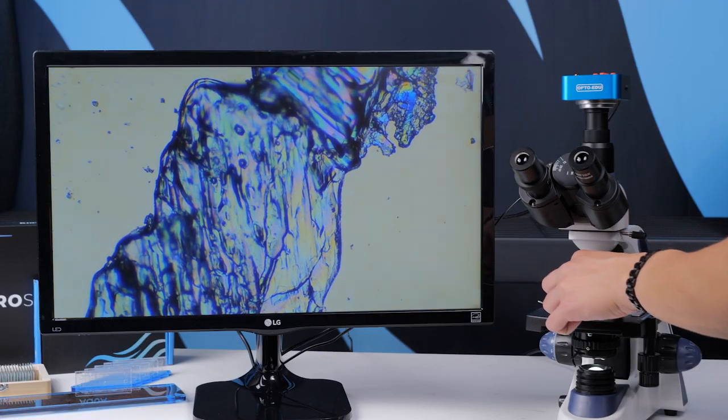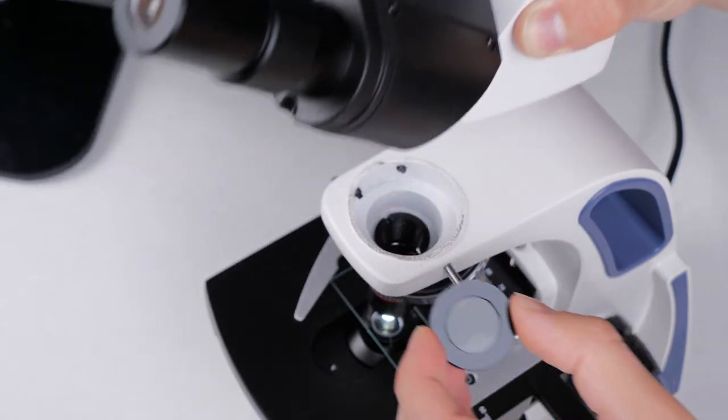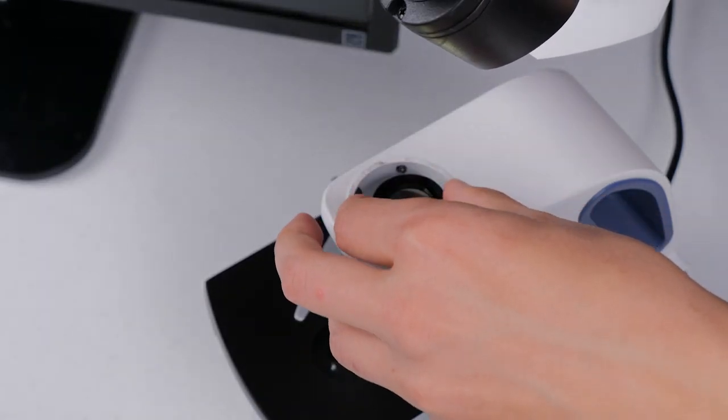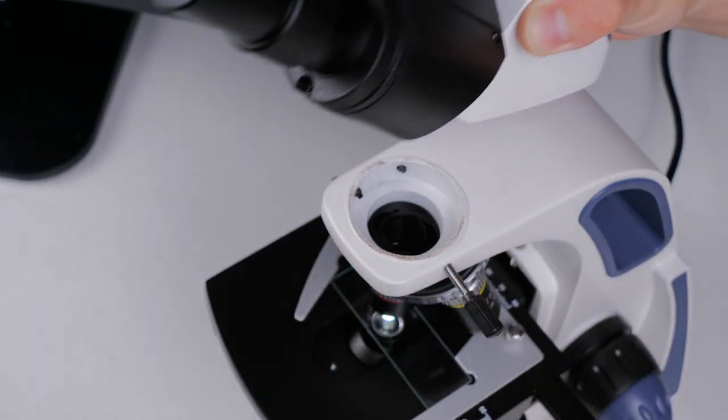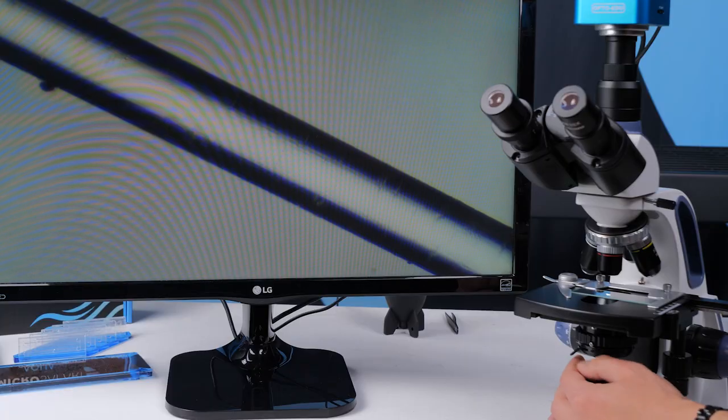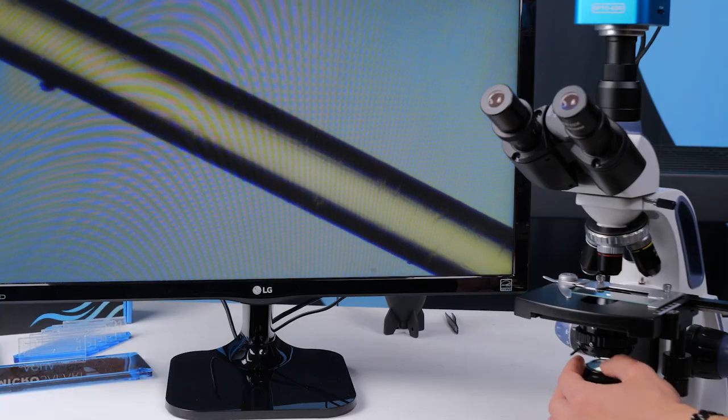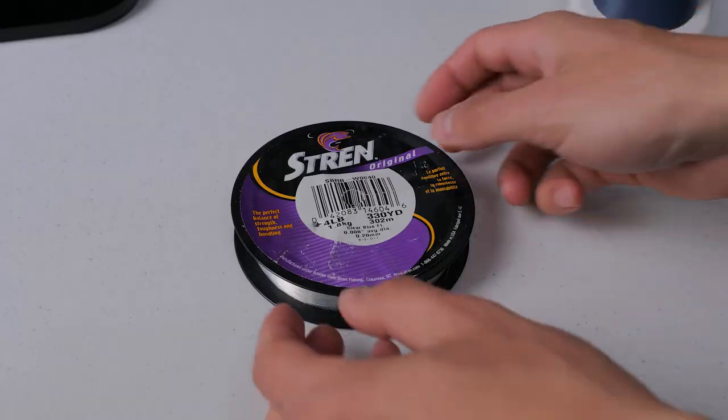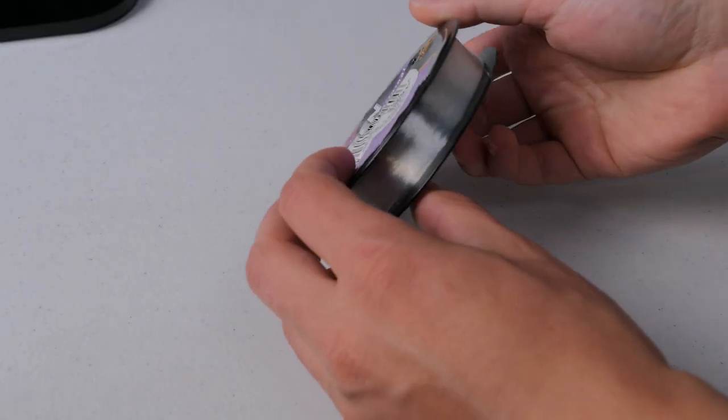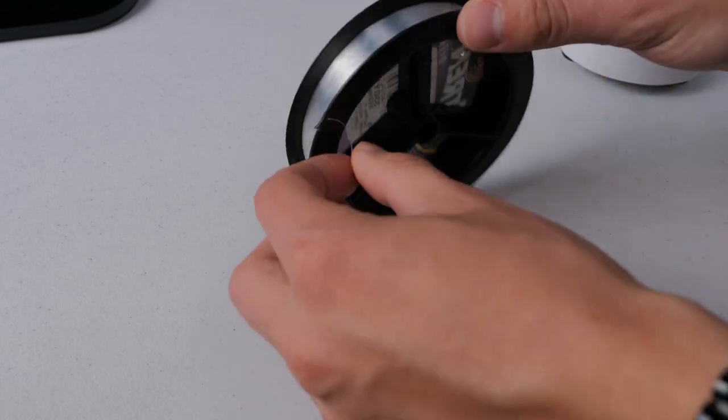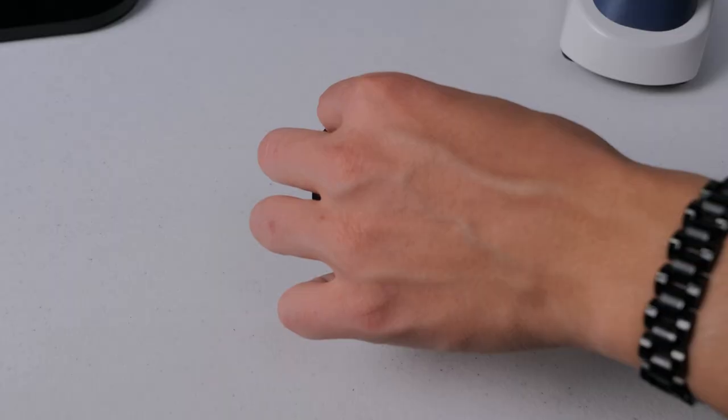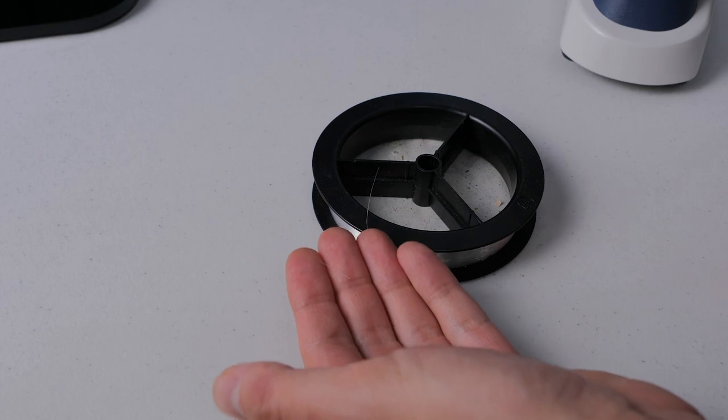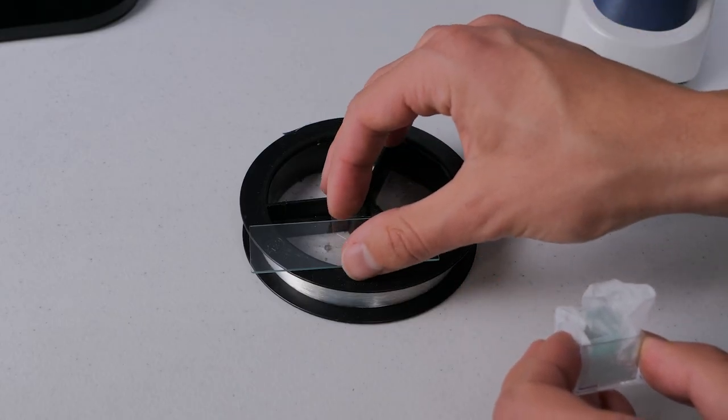To change the polarization angle you'll need to rotate the polarizing filter in the filter holder or if you're using the manual flag you can just rotate that. There are many samples that work well under polarized light conditions. For testing and calibration I recommend using nylon in some form, either bristles from your toothbrush or fishing line, placed on a microscope slide under a cover slip.